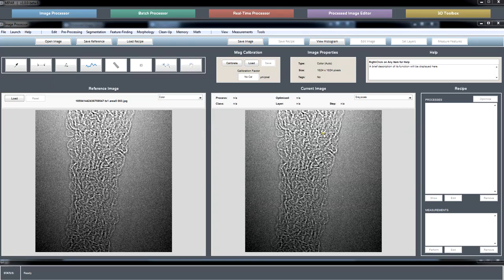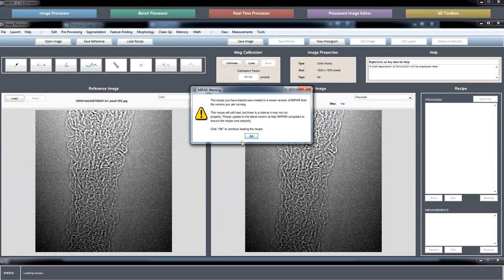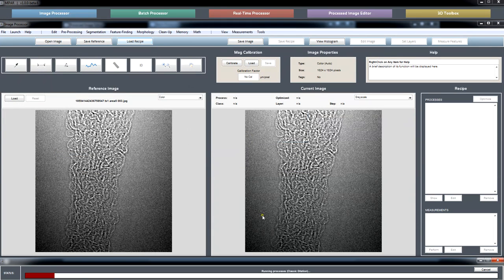He did provide a link to the publication that this is part of, and I will try to post that later if anyone is interested. These are some sort of molecules that I think definitely meets the standard of a noisy image.